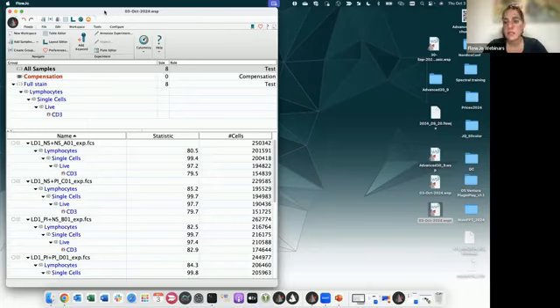So we need to work with a single FCS file. It doesn't matter which platform, whether it's FlowJo or another platform, everyone will need to work with a single FCS file if they want to move on to high-dimensional analysis, which could be, for example, a t-SNE plot, a UMAP plot, and so on. This action of creating a single FCS file is called concatenation in FlowJo.